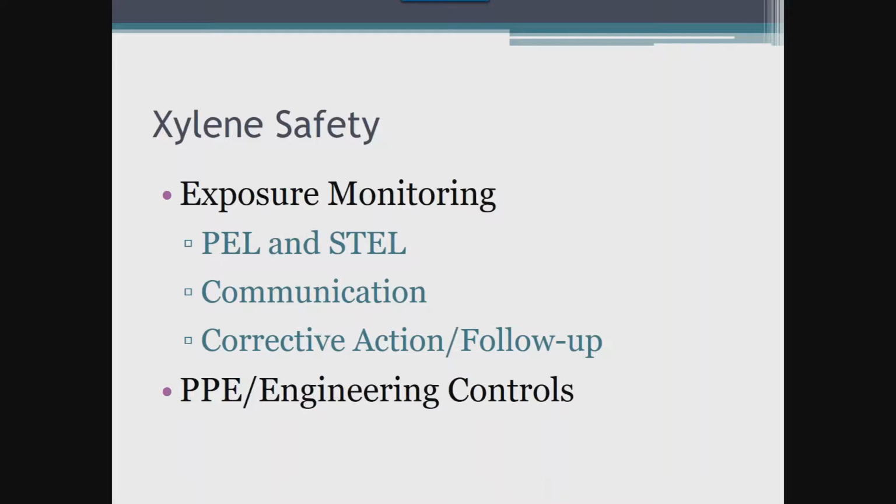Similar to formaldehyde, exposure monitoring must be communicated with employees as it occurs so that they are aware of the laboratory's compliance and their risk and safety. Employees must wear the appropriate PPE and engineering controls when handling xylene. These are similar to that of formalin.